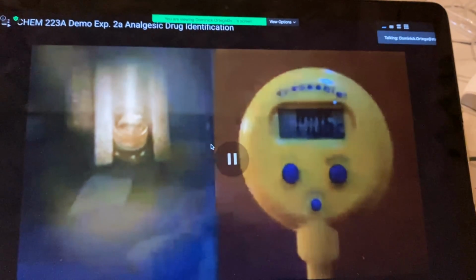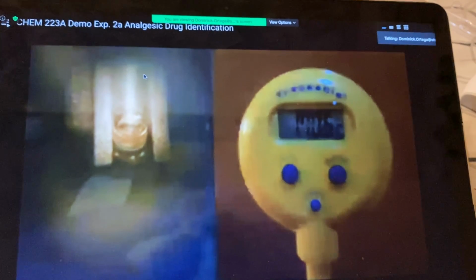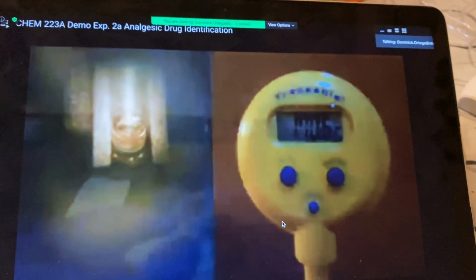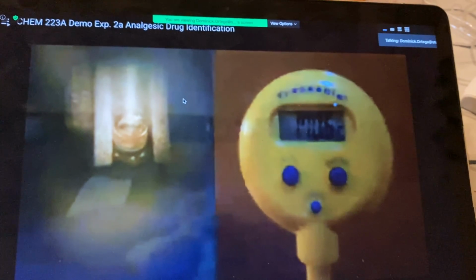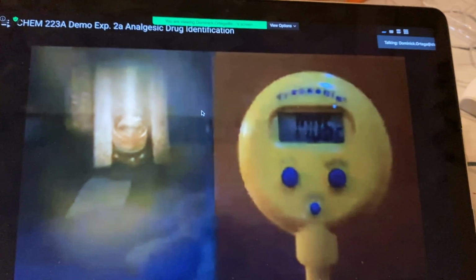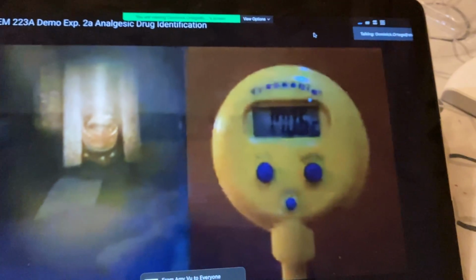When you're doing this in the lab, you have one chance. So you put the tube in there, you look. If you're not paying attention and you miss it when it dissolves and you miss the temperature, then you have to do it again. So you have to prepare another capillary tube and keep doing it until you get the correct range.